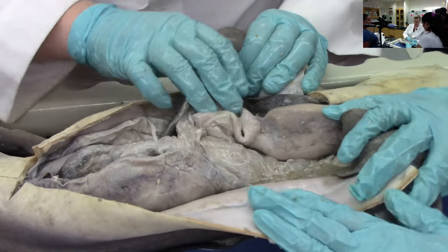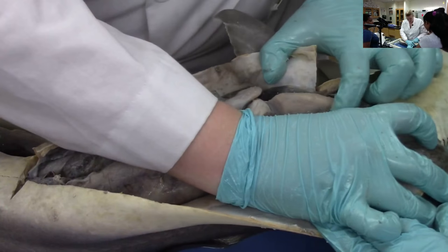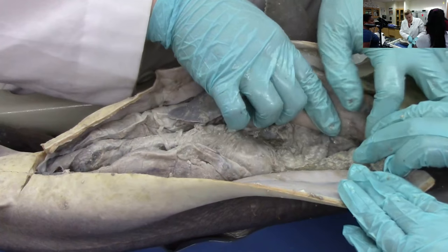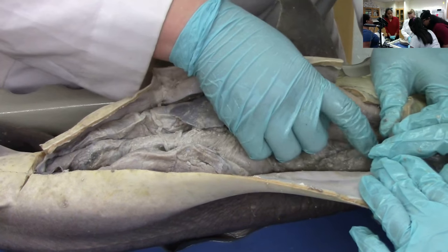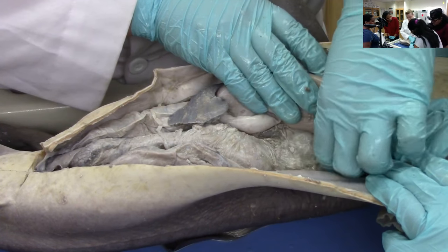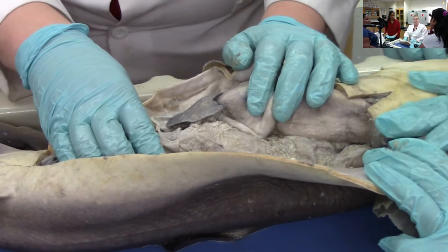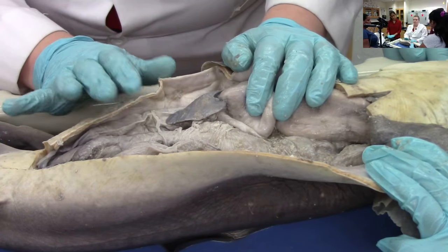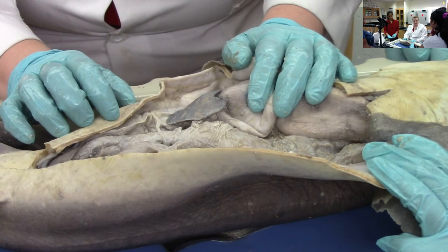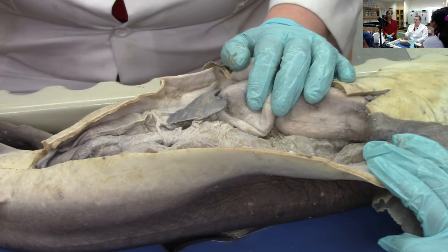Do you want to look at some babies? There's the babies. You see this ball up there? That's an ovary — that's where the eggs are. It goes through a gland where they put egg cases on the eggs. Sharks have different ways of reproducing: some give live birth, this one gives live birth, some lay egg cases. If you've ever seen a mermaid's purse — those little black egg cases that stick on seaweed — those are shark egg cases. And some have eggs that hatch inside the uterus and then give live birth. So they have three different ways of doing it.